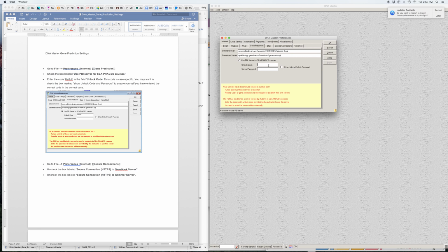And this is case sensitive, so make sure you use a capital H, A, T, F, U, and 2 L's. And now we are going to click on Apply. And so that should be all set. If we don't do this, your auto annotations won't work, so make sure you follow the directions here carefully.